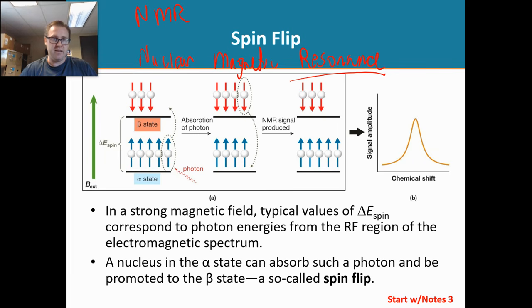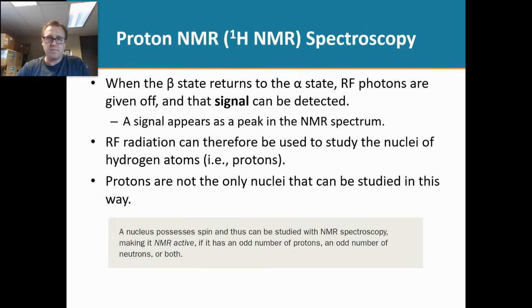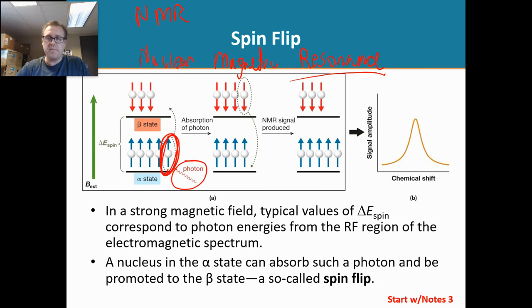It is resonated. And resonance simply means that the nuclei right there is absorbing a photon of light. Okay.